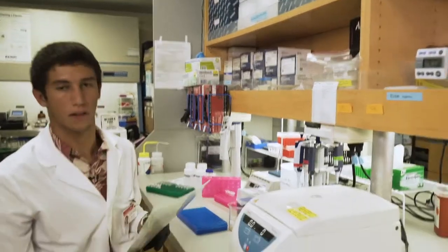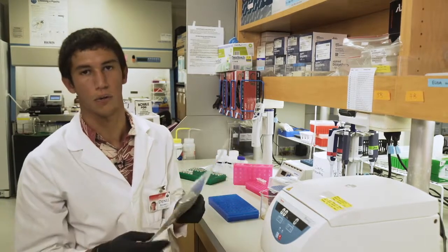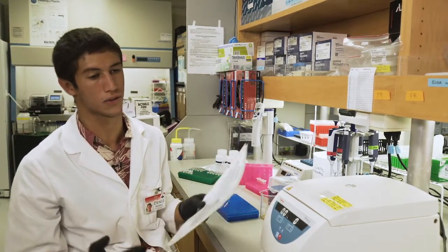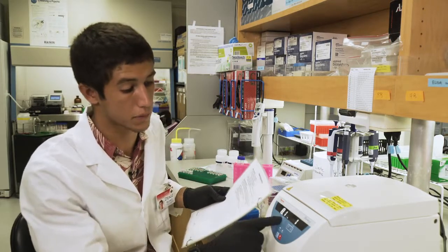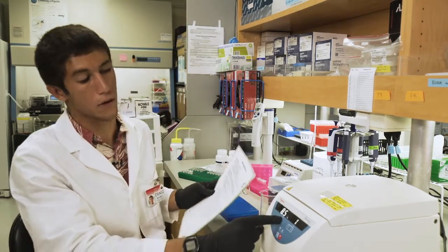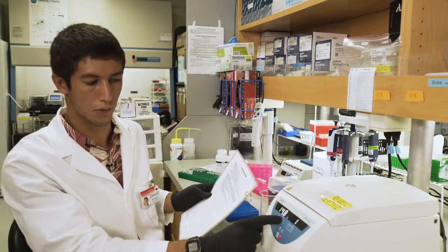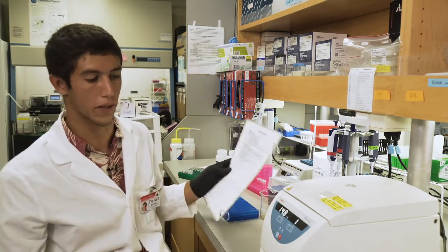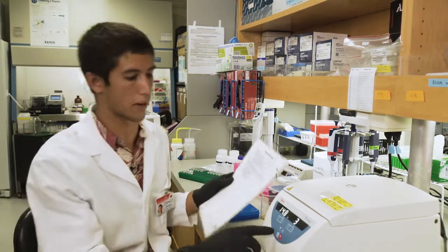And so this is going to be our last wash buffer. We're trying to get any liquid on the columns off of them. So for this one, we're going to turn the speed up to maximum. For this centrifuge, that goes up to about 14.8 thousand RPMs. And we're going to spin it for 3 minutes so that all the liquid is definitely off.